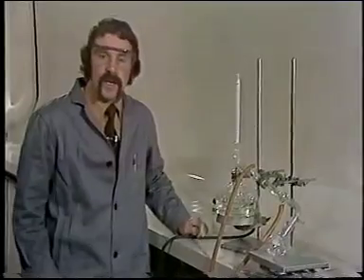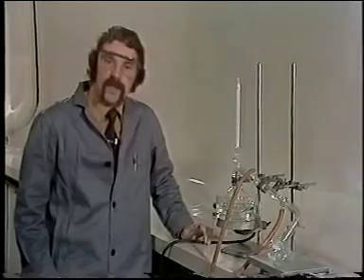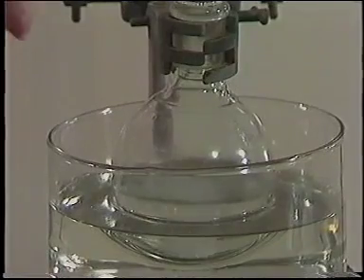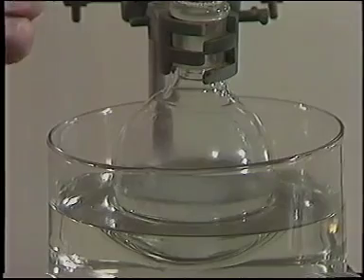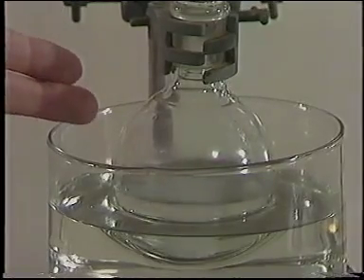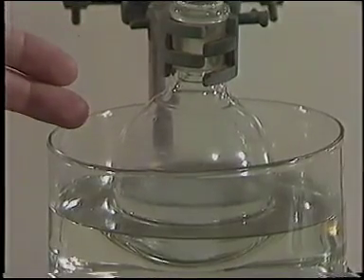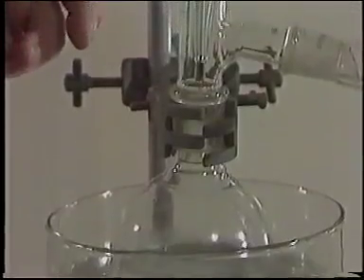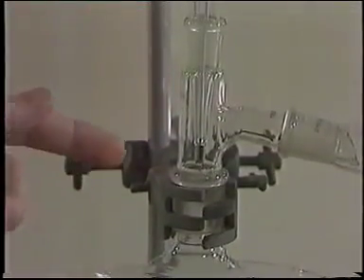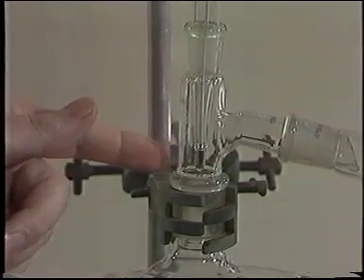The differences are that the lab apparatus has to be more versatile to handle a wider range of boiling liquids. We have to be able to take our apparatus apart for easy cleaning. We use anti-bumping granules to ensure smooth boiling. And quality control is measured by the temperature of the vapor in equilibrium with the liquid at the thermometer bulb.